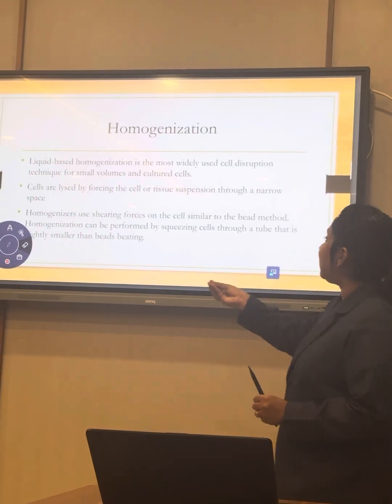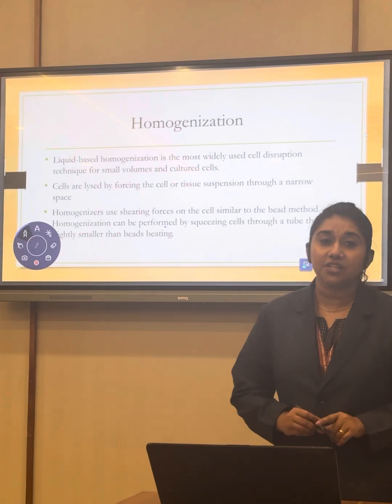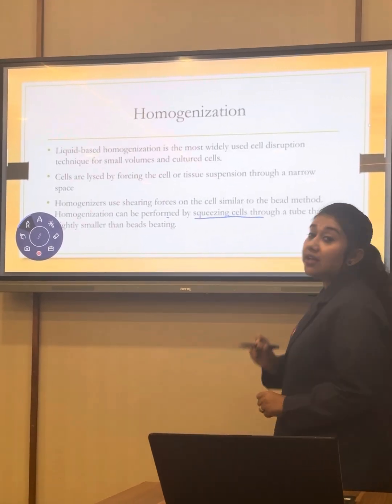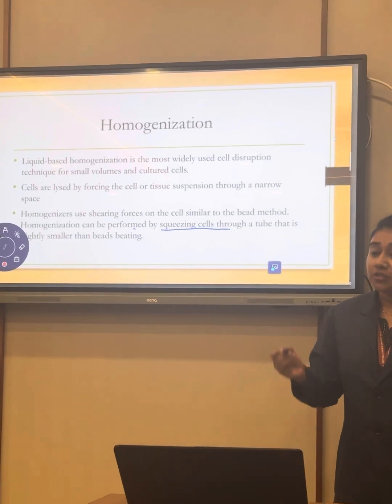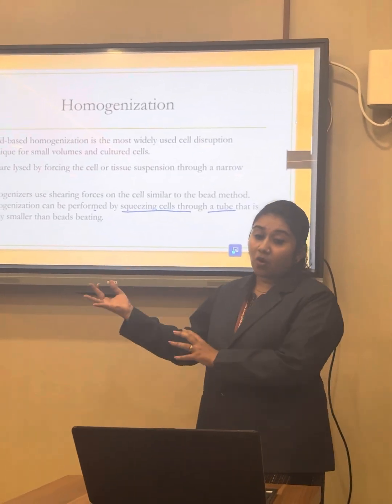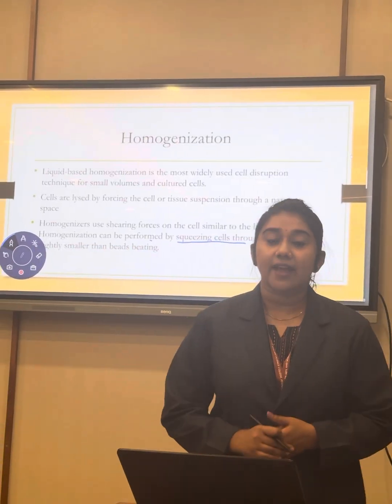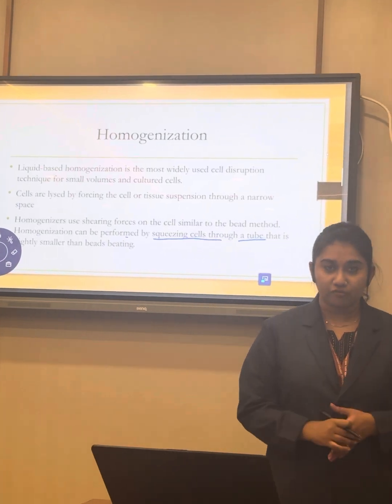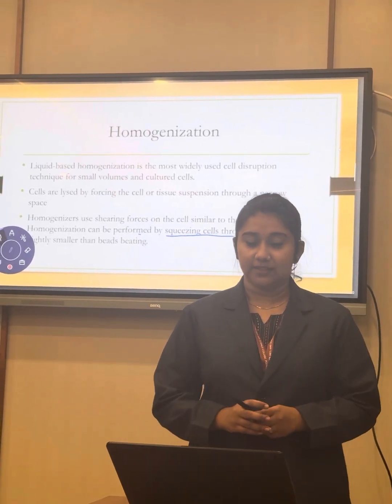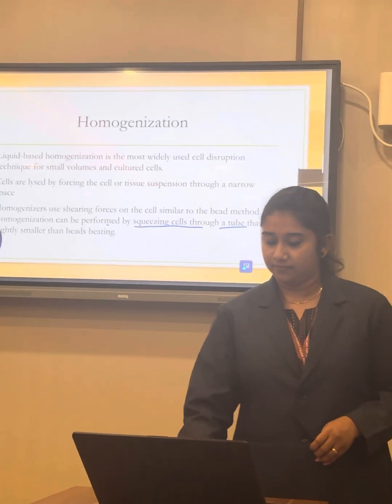Actually, here it is similar to the bead beating method. The homogenization is performed by squeezing the cells through a narrow tube. So it is smaller than bead beating. These are the types of mechanical methods related to cell disruption. Next we are discussing the non-mechanical methods.